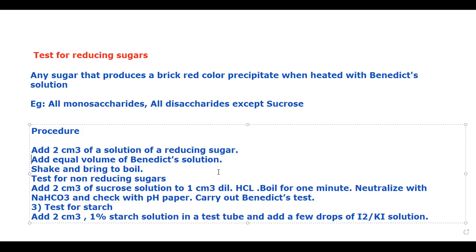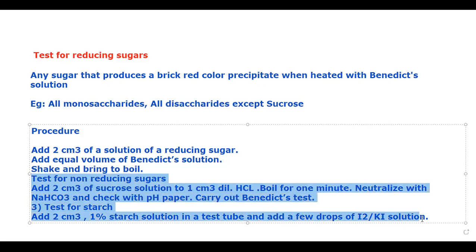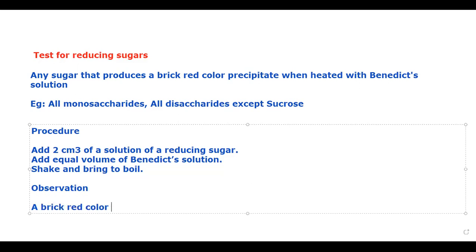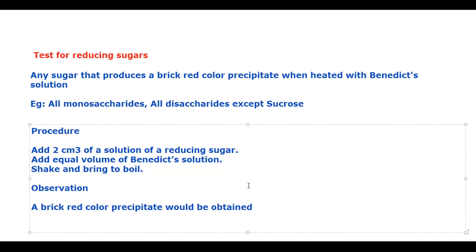You have to shake it well and boil it well. When you do it, what is your observation? A brick red color precipitate would be obtained. Clear?